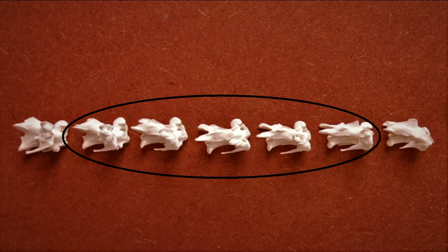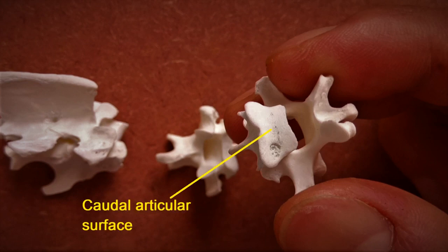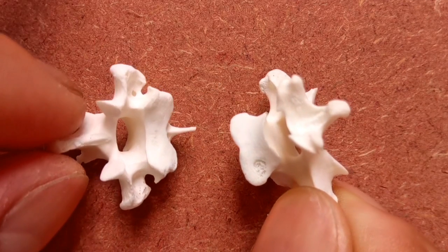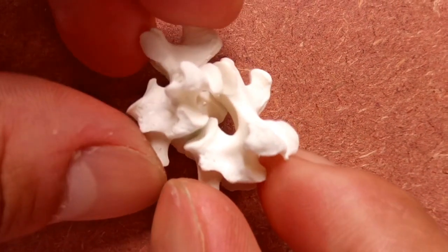So what you can do is employ a sort of trial and error method. Each vertebra has at the anterior or top end a well-defined, roughly concave region called the centrum, surrounded on both sides by a pair of joints called the prezygopophysis. At the posterior or bottom end is located the caudal articular surface surrounded by a pair of joints called the postzygopophysis. The caudal articular surface and the postzygopophysis of a preceding vertebra connects to the centrum and the prezygopophysis of the succeeding vertebra. Connect these joints in that pattern to find which two vertebrae fit perfectly, then work your way through the rest.